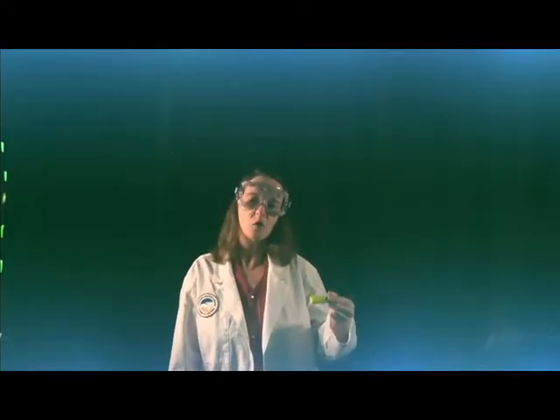Today's topic: atomic absorption spectroscopy and hard water analysis. You're going to analyze a tap water sample for hard water ions. Calcium and magnesium are both hard water ions.